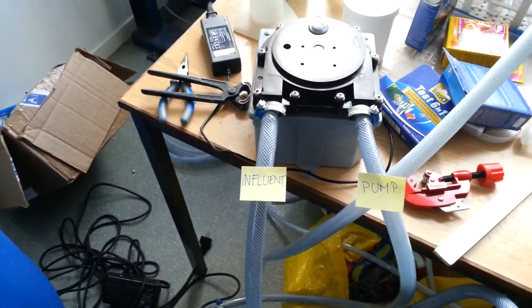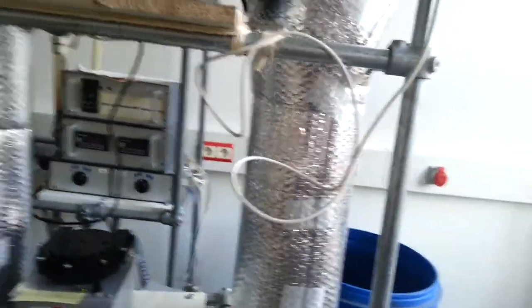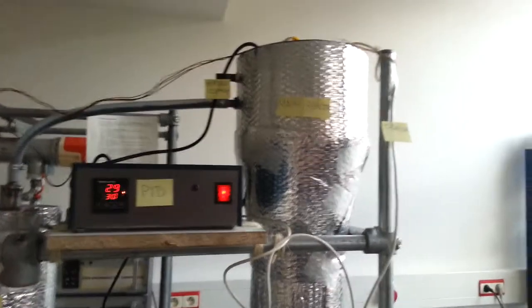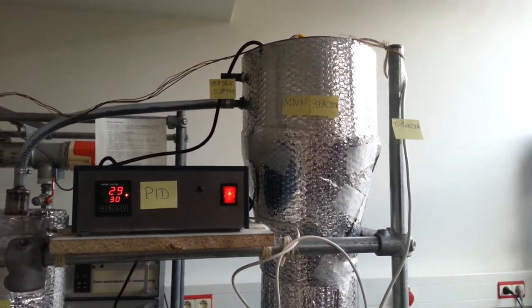It is pumped via a peristaltic pump into the main reactor where the bacteria are kept at 30 degrees Celsius. To retain this temperature we use a sensor and the heating element coupled to a PID controller.